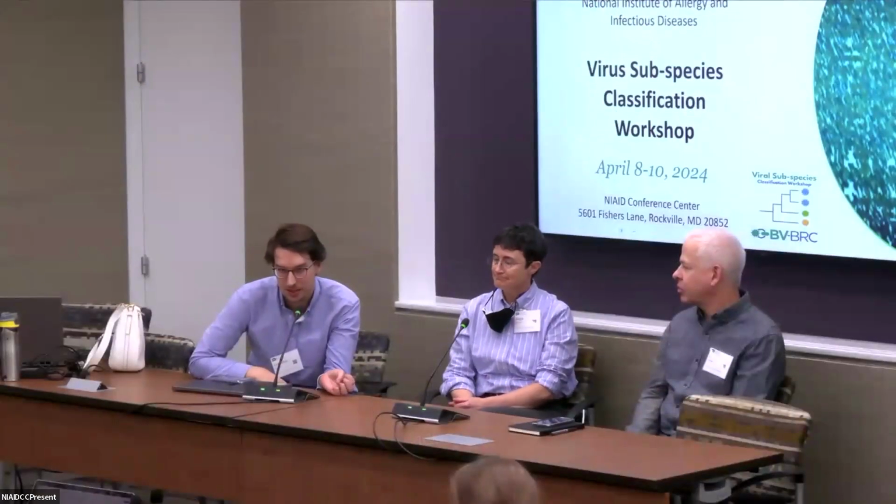Yes, it could be applied to all sorts of viruses, even HIV. I think Richard has played with it, although there are difficulties with recombination. Nextclade is useful, but you need to make a dataset, and it's not very complicated to make a dataset to make it somewhat useful.